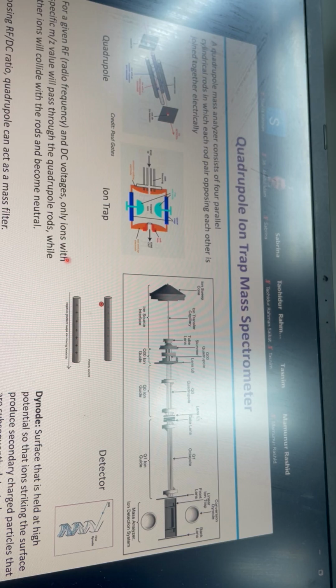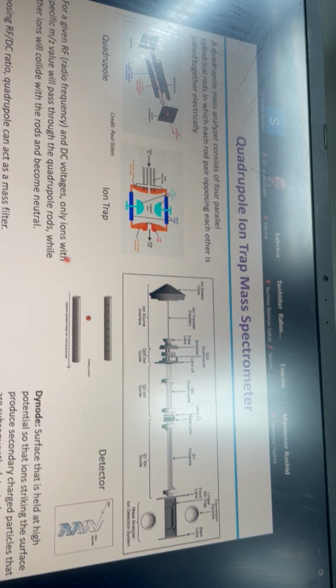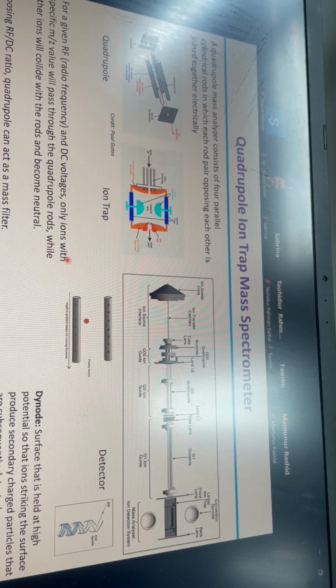So in capillary electrophoresis, you apply voltage on the capillary. Yes. But in ESI, you also apply voltage on the stainless steel capillary, but it's not actually separating anything in the capillary. It's long, but it's just introducing sample to the ion source. Simply.